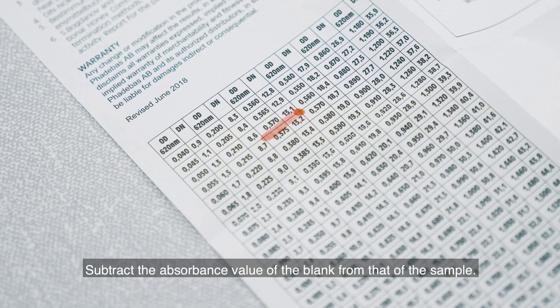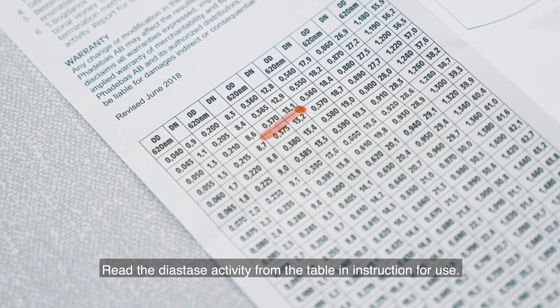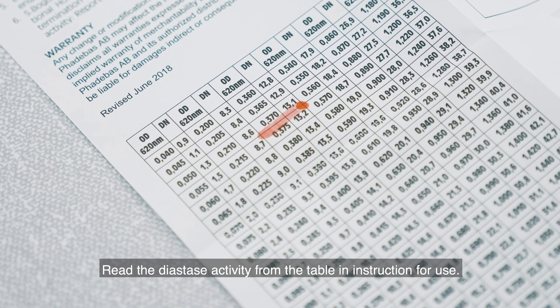Subtract the absorbance value of the blank from that of the sample. Read the diastase activity from the table in the instructions for use.